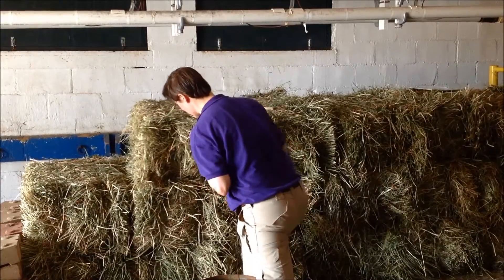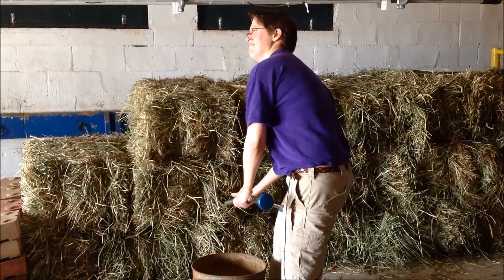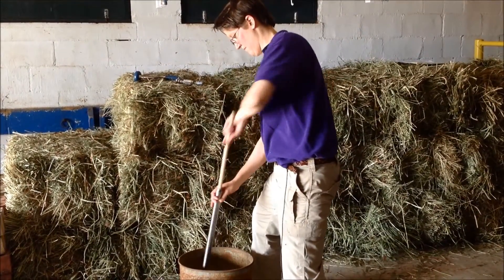Insert the core sampler at a 90 degree angle into the center of the end of a small square bale. Mix the cores in a clean pail. Then place the entire sample in a clean plastic bag or other container and seal tightly.